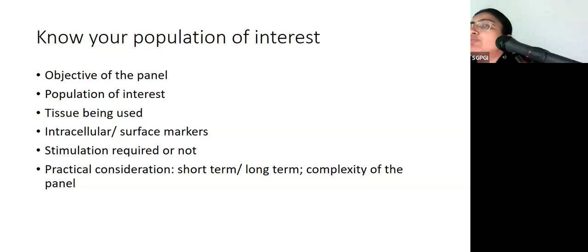Now, the next step is stimulation. For those of you who want to assess cytokines, or maybe for PID, say PMA stimulation where you want to see the DHR emission in the granulocytes, you'll always see that in the stimulated cells, the unstained cells will also move. So that also is a consideration that you need to have.